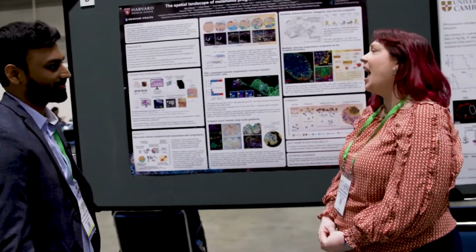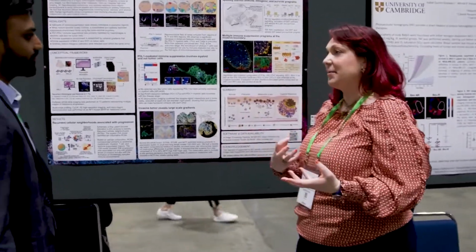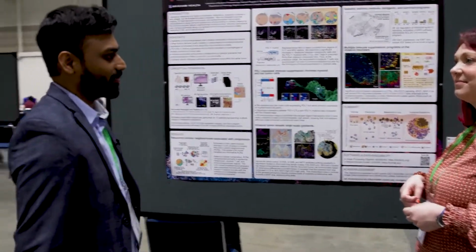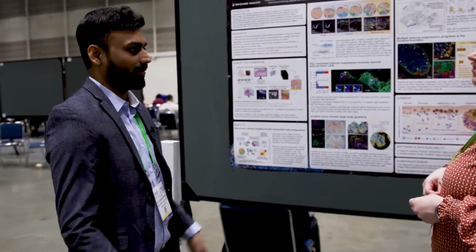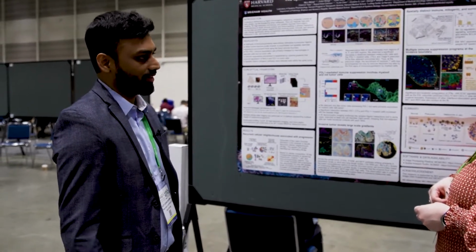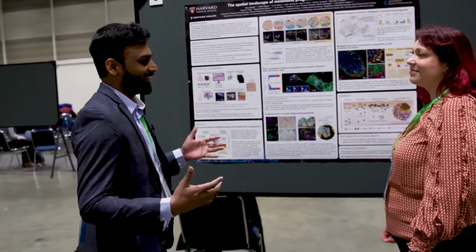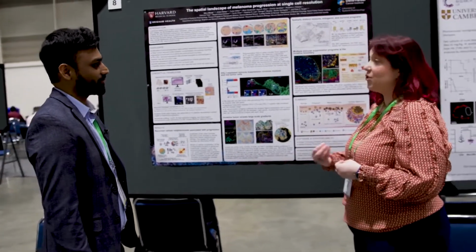I see, I understand. And so one final question, you talk about single cell resolution. You're obviously aware of the CosMx Spatial Molecular Imager that's coming out later this year. Are you guys doing any experiments with that? Yeah, so we are very interested in CosMx, and obviously the 100-plex protein assay and the 1000-plex RNA assay. I think there is some collaboration between Peter Sorger's lab and NanoString, and hopefully we'll be able to work together in the future. And I'm really looking forward to using that much data to get a better understanding of these early precursor lesions. Yeah, I think it's really important to catch it as early as possible, right?